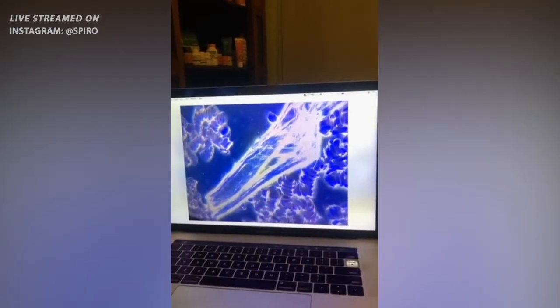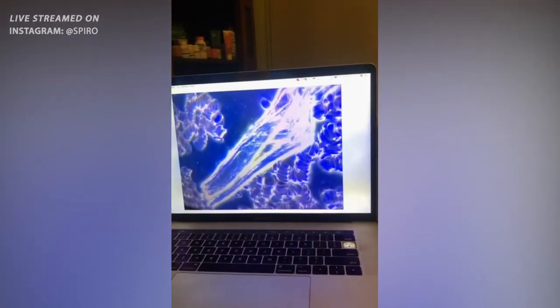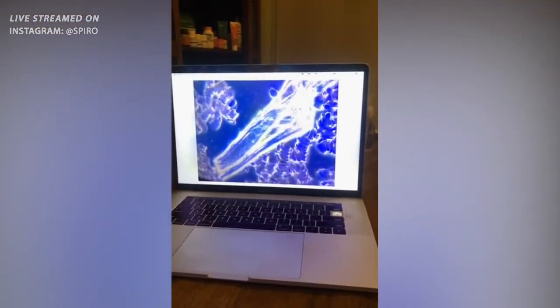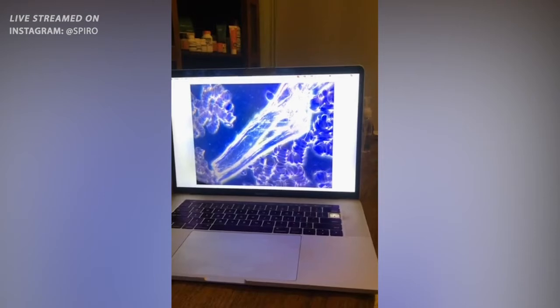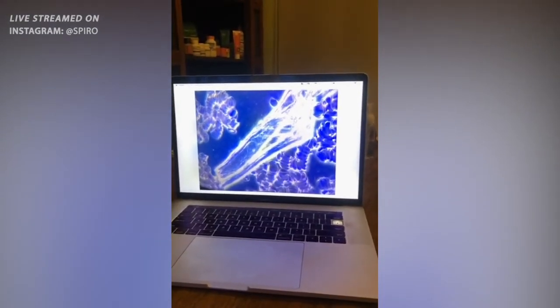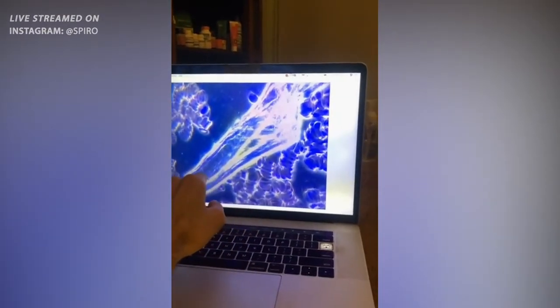So have you ever seen this before? No. You have never seen this before. No. How many years have you been practicing? 30 years. So Dr. Peggy has been practicing for 30 years, guys. She's never seen anything like this. Let that sink in for a moment. She's been testing blood for 30 years and she has never seen this unknown object.